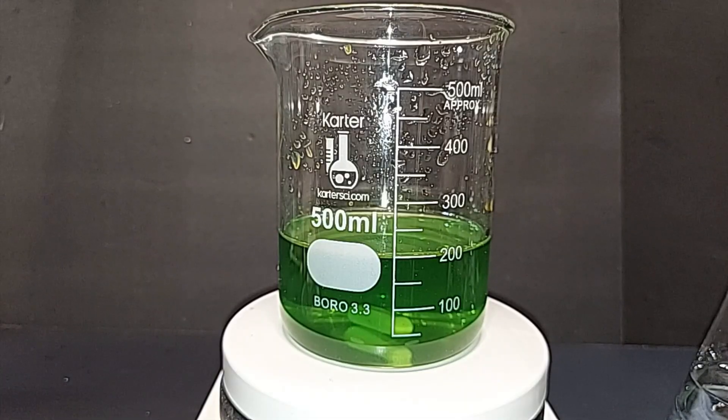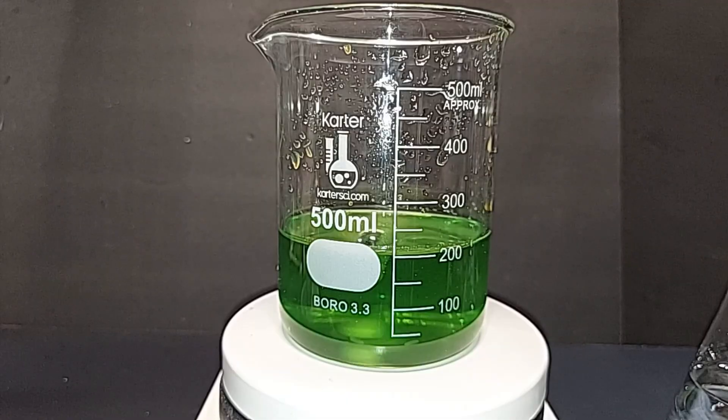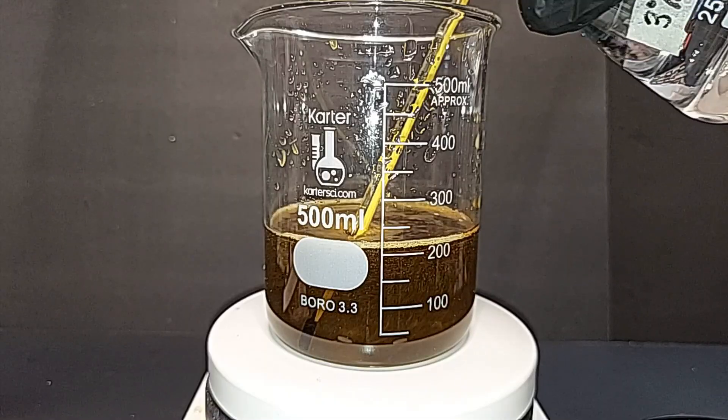Turning the magnetic stirrer back on. When we add hydrogen peroxide there will be an immediate color change as ferrous chloride converts to ferric chloride. There might also be some fizzing — remaining free iron will cause the hydrogen peroxide to release oxygen gas. We want to keep this below about 60°C to prevent thermal breakdown of the hydrogen peroxide. Placing a thermometer in and monitoring closely. Adding the hydrogen peroxide now — you can see the immediate color change and the oxygen fizzing.